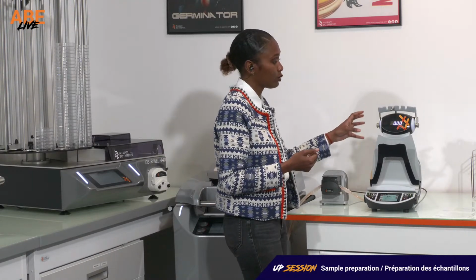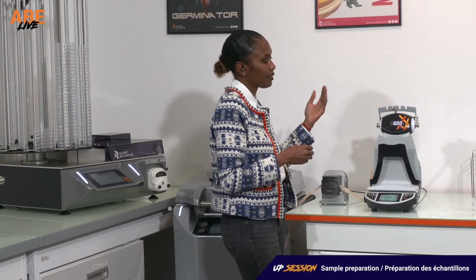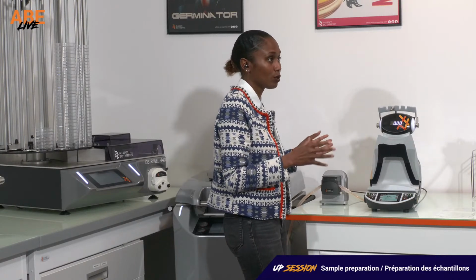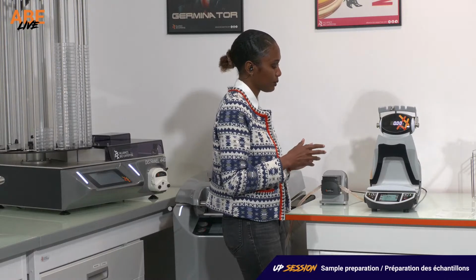You have the color code here. You know when the DILUWEL is on hold, like now. When it's ongoing, it's blue. When it's green, it means that you're okay. So you can do everything with just looking at this part.